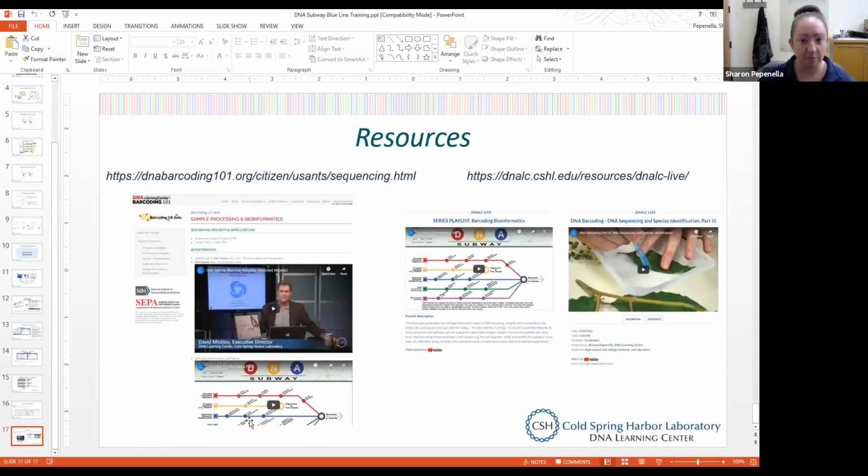And then lastly, I have a couple of resources here. We have a number of videos I mentioned at the beginning, some walkthroughs, some training, some tutorials that are available to you. I will put them in the Google Classroom, of course, but they're also available on the website that I sent out in, I think, 2 emails ago, the DNAbarcoding101.org website, where we now have a citizen science section. So that is available. Videos, this is of course Dave, who has a very, very nice webinar that analyzes sequence data, so you're welcome to use that.